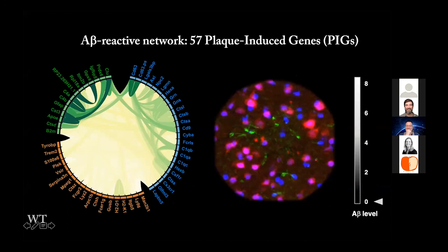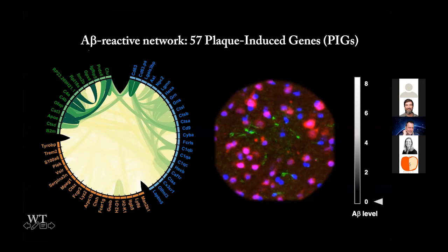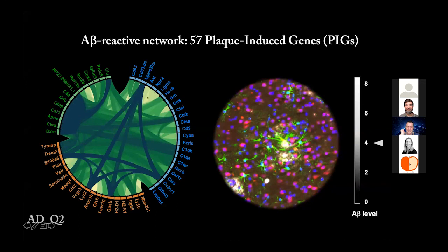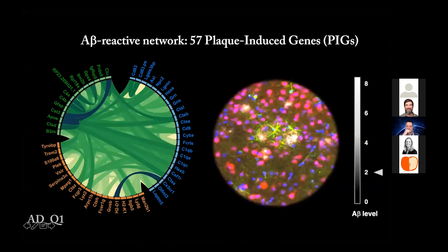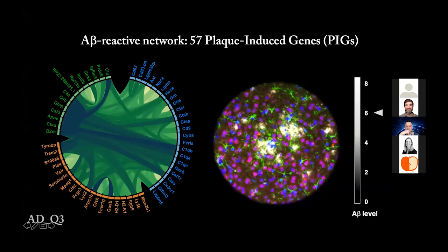A quick observation from my end is this network: it seems like this is an astrocyte subgroup, and this is probably mainly led by the microglia. There's not much communication between those two subgroups in the wild type, but they start to build up with mild amyloid-beta deposition. Which comes first, I don't know; maybe they have more internal connectivity and higher expression of the astrocyte subgroup in our network in the wild type brains. But when we start to have more amyloid-beta deposition, there seems to be more interaction, and we might get further hints about what aspect of the interaction from the connectivity between the gene pairs. But I think that's definitely a fantastic question. I need to think more about it.